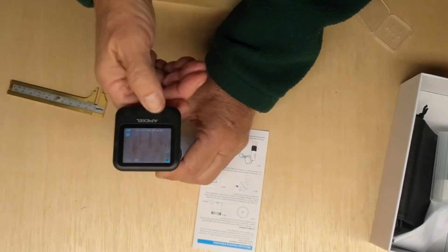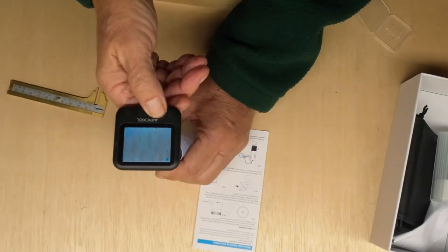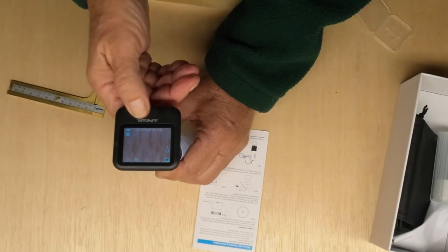The screen can be tilted back and forth, and the brightness of the light can be controlled by holding down on the plus and minus button.